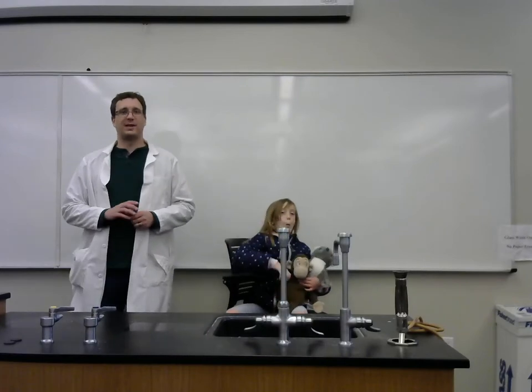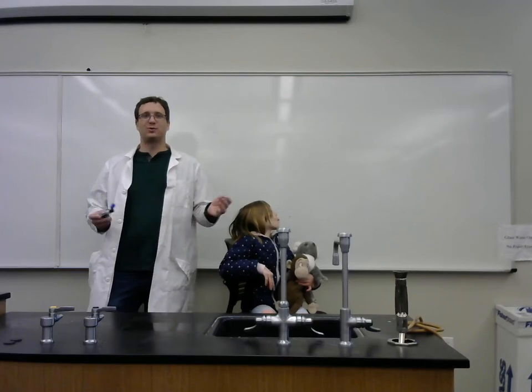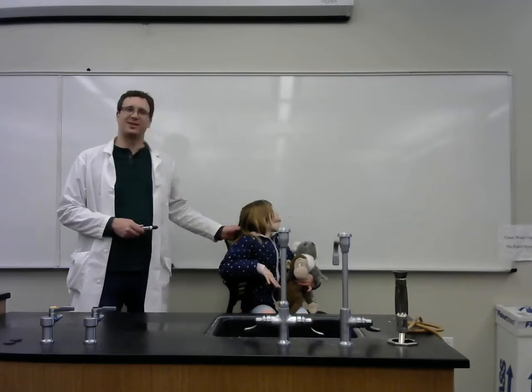Okay, welcome. Today we're going to be doing the acid-base chemistry lab. And because schools are closed, we've got my assistant Lily Rowley with me today.